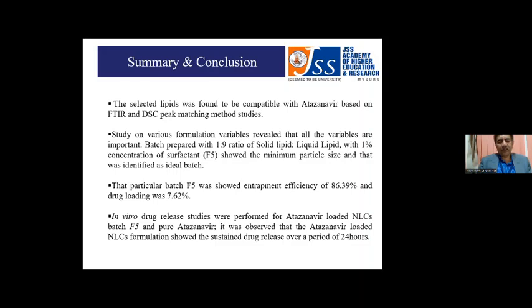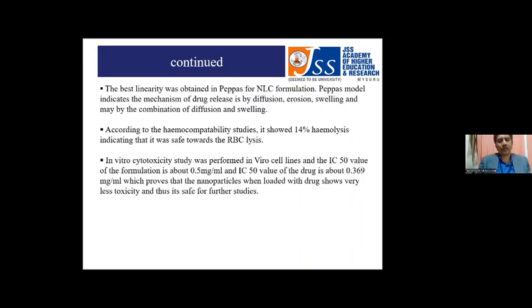The in vitro release studies were performed for all the batches with pure atazanavir. The atazanavir loaded nanolipid formulation from batch F5 showed a sustained release of drug over a period of 24 hours. The best linearity was obtained with the Peppas model, and chiefly this model represents drug release either by diffusion, erosion, or swelling, or a combination of diffusion and swelling. According to the results of the hemocompatibility studies, it showed 14% hemolysis, indicating it was safe towards RBC lysis.